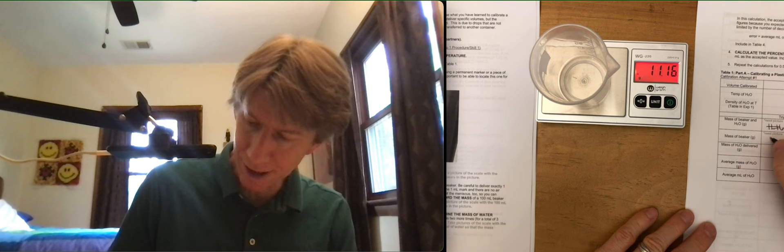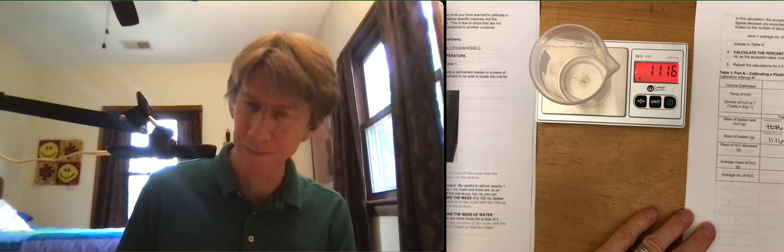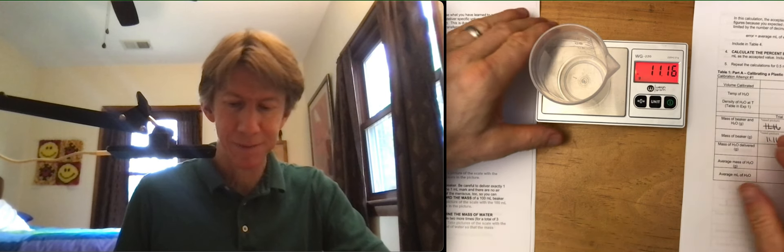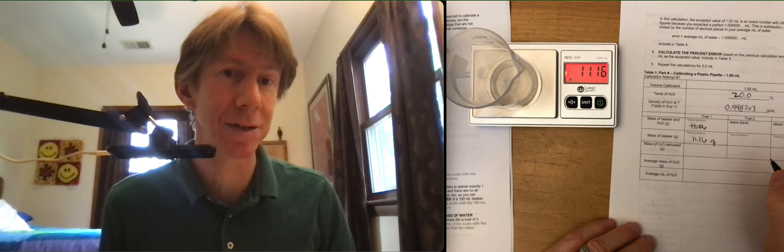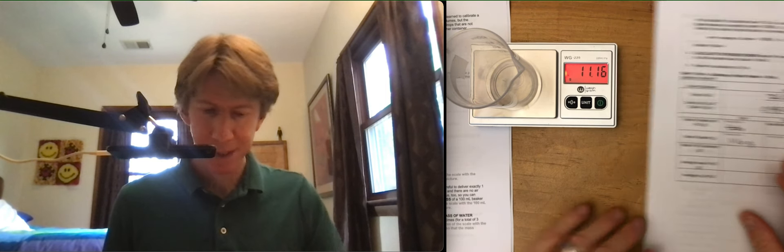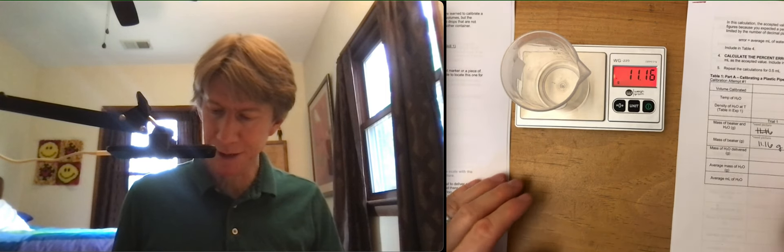Looks like 11.16. I've got my mass of beaker down here this time, which means that I need to move these around, because my mass of beaker in H2O should be up here. This is what I need the picture of, so I'll change that for your version of this. All right, 11.16 grams.